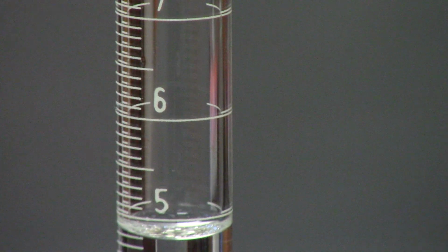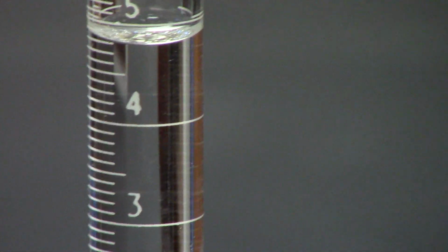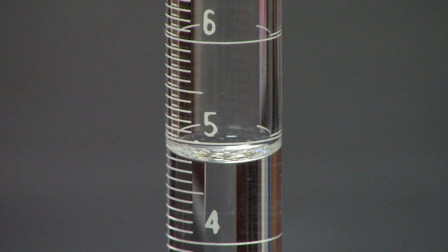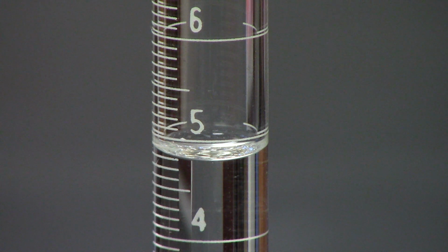Sorry about that. Okay. All right, there you go. So, to me, from this reading, it looks like it's 4. You can see it's just under 5, and it looks like it's 1 hash under 5. So it's going to be 4.9.